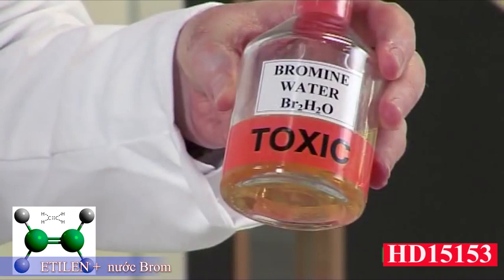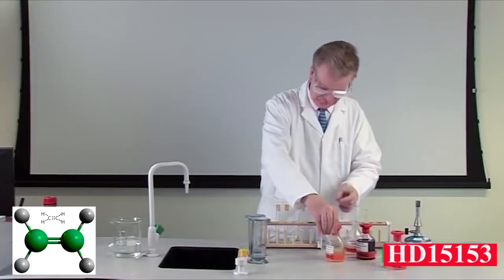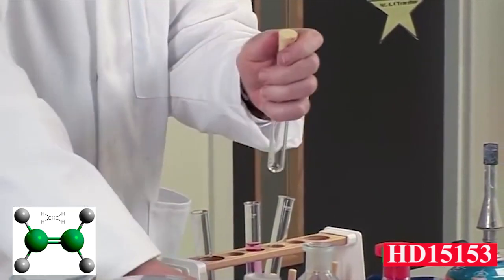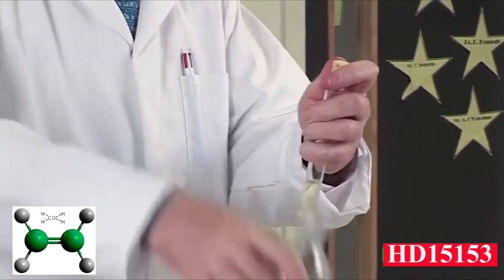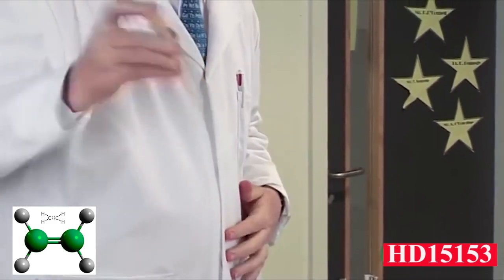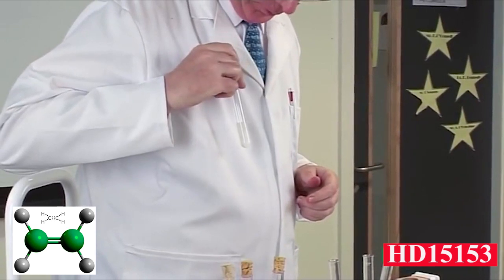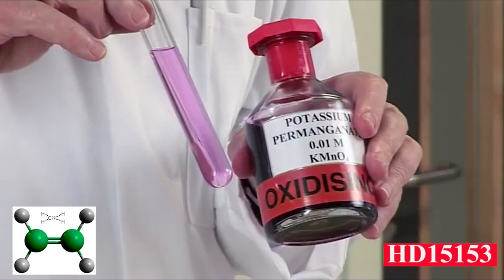Addition of bromine. Alkenes are more reactive than alkanes because of the presence of the carbon-carbon double bond. Let's see what happens if we add some bromine water to a test tube of ethene. Replace the stopper and shake the test tube a few times. Note that the yellow color of the bromine water solution disappears.